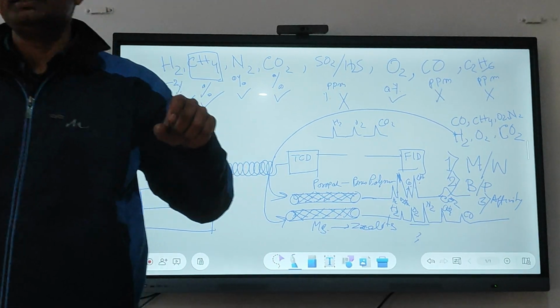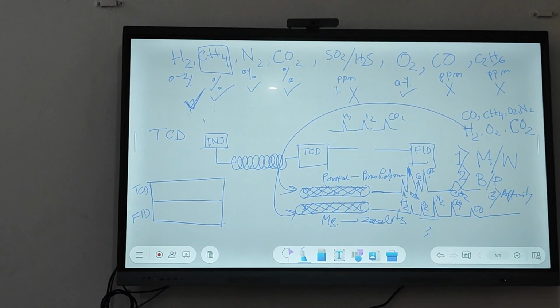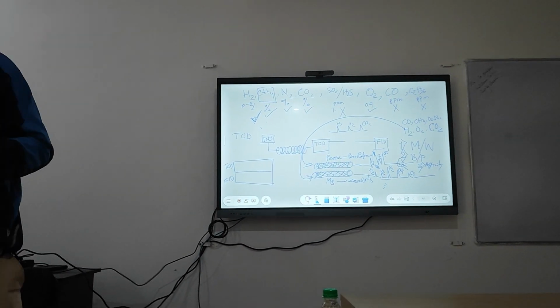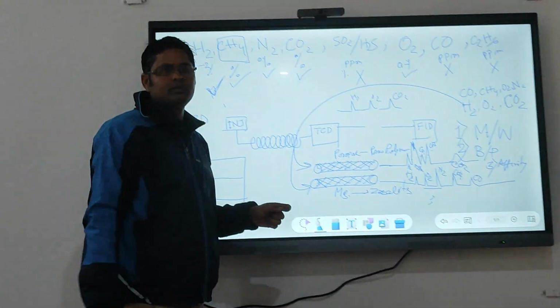Affinity in the sense that so many things can be involved, like adsorption, polarity. So many things can be. It's collectively called affinity.